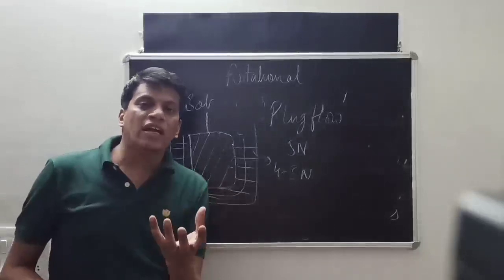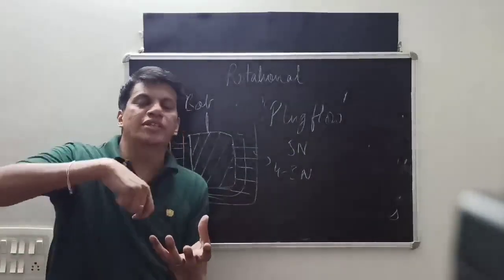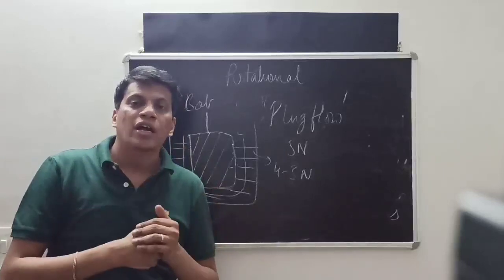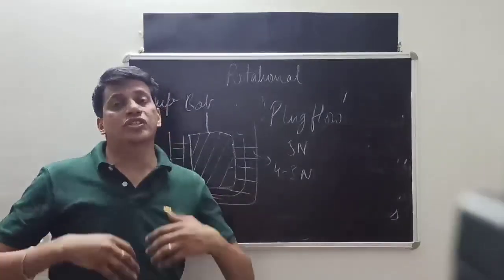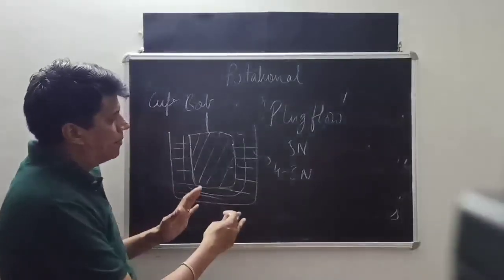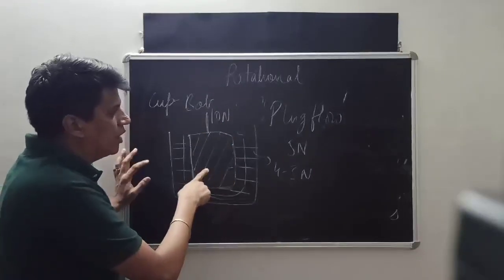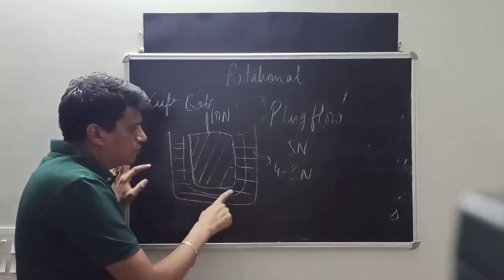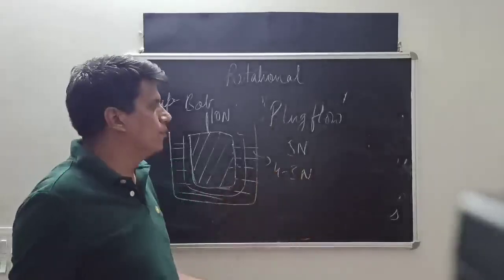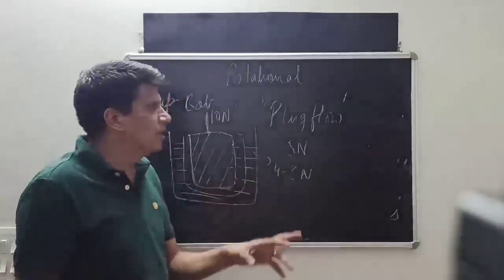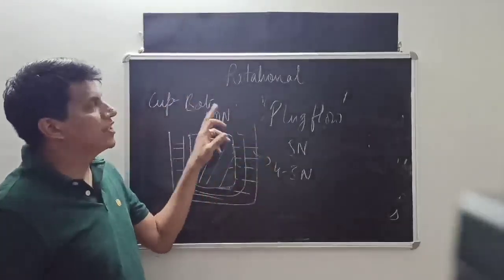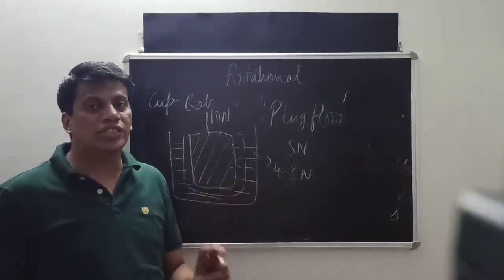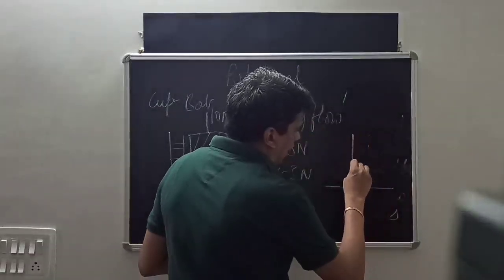This phenomenon is called plug flow, which is characteristic of plastic material tested in cup and bob viscometers. For example, take jam in a bottle — apply force in the center and you will see that only the center moves; the jam close to the container walls does not move until force exceeds a much higher value. When force is 10 N more material moves, but at 5 N only the inner material moves, causing incorrect results. To overcome these two disadvantages, cone and plate viscometers were developed.